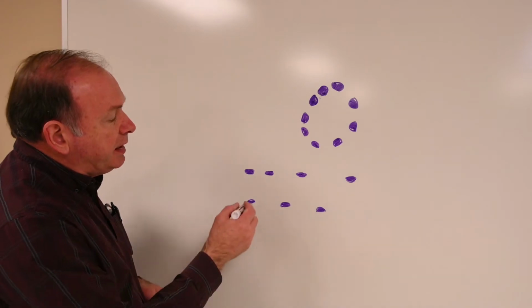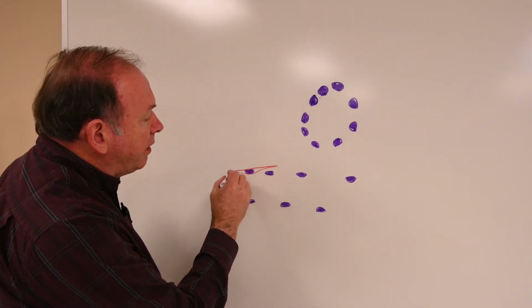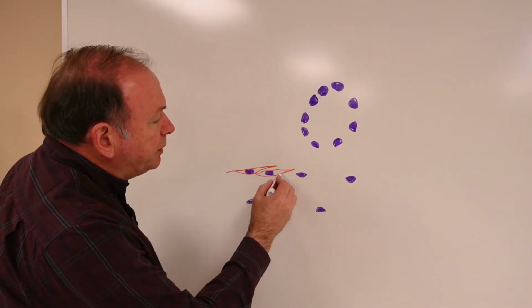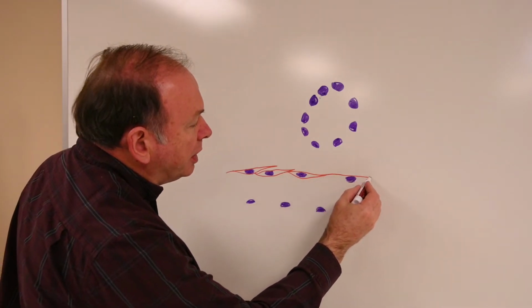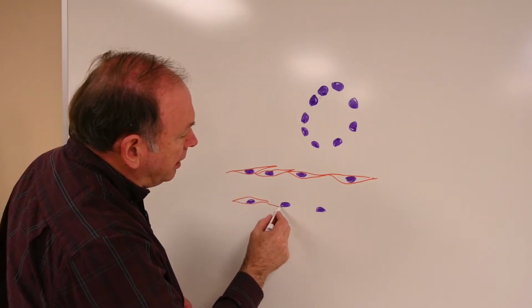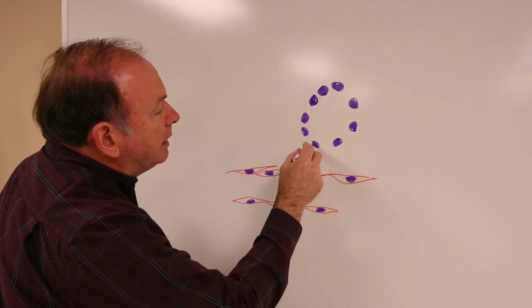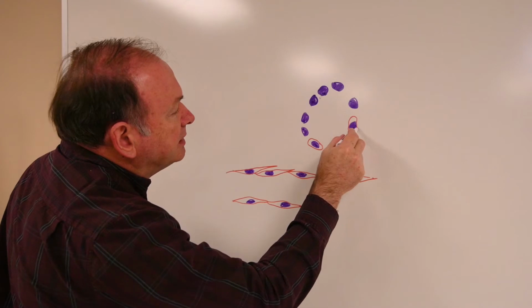If you were to see the shape of the endothelial cell, you'd see it's a very elongated kind of cell, and there's gaps between the cells all around the margin of the splenic sinus area. So we'd have that surrounded by a cell, that would be surrounded by a cell.